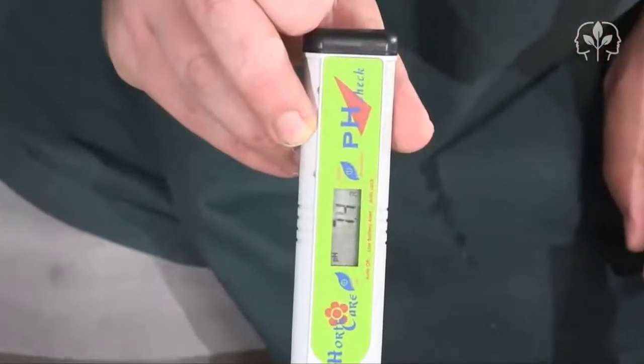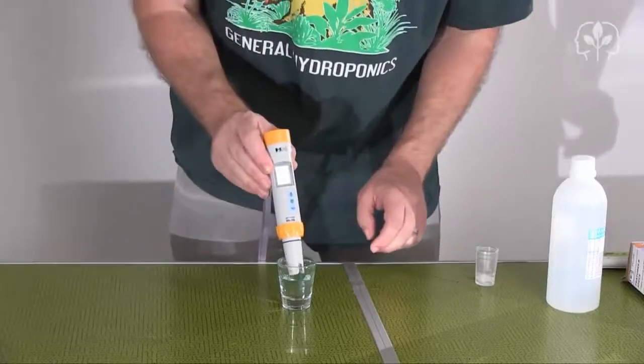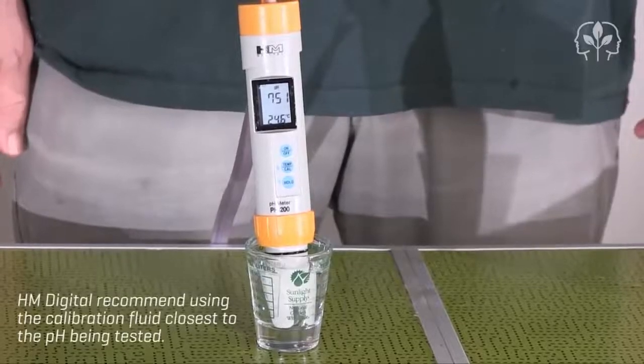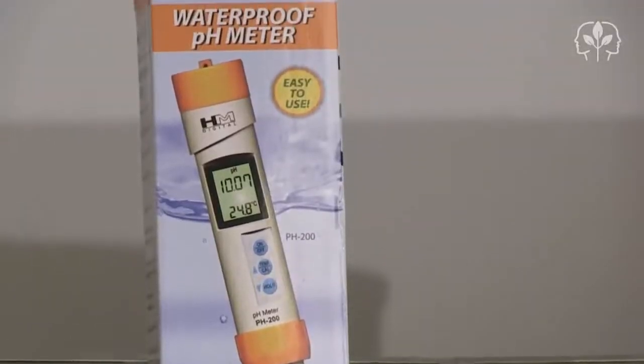Next let's take a look at the HM Digital pH 200 — it's reading over 7.5. So as I suspected, both meters need recalibrating. Fortunately it's really easy.